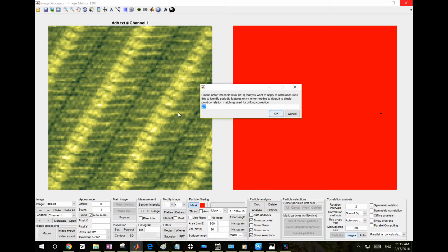Only if the match is above a certain threshold do we classify them as a match, otherwise they're not matched. So this gives you some control over what's matching and what's not. Typically, the higher the number, the better the quality of the matching.